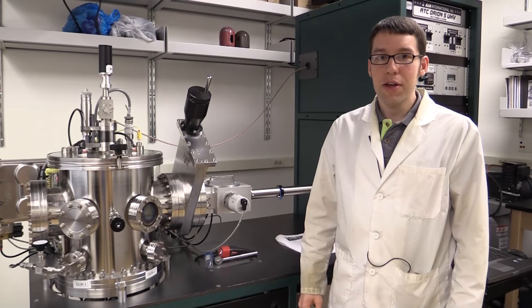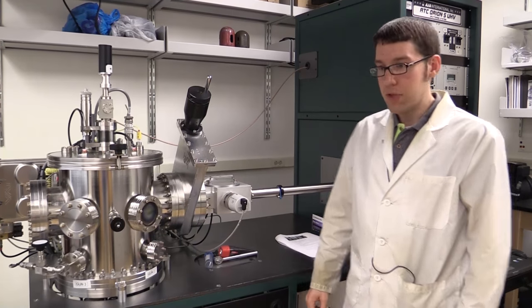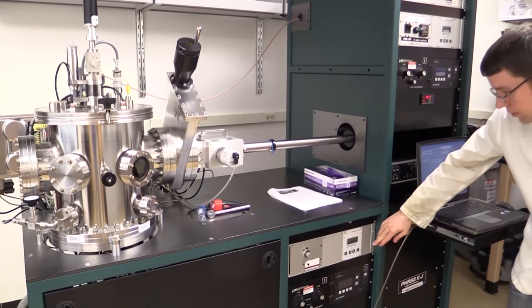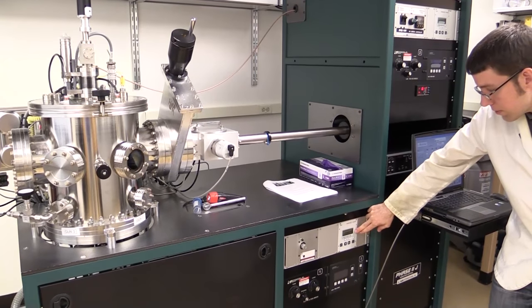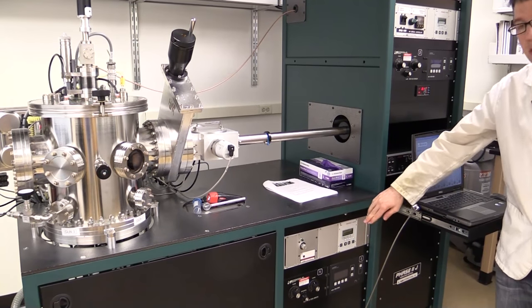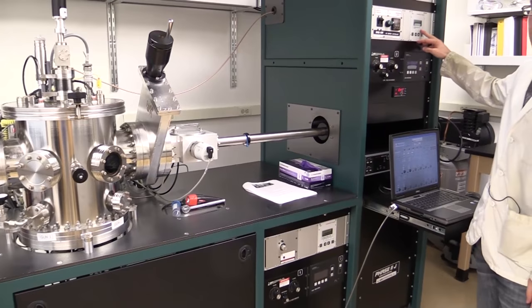Now we have a vacuum in the load lock chamber, which I can see on this pressure gauge. Currently, the vacuum is 2 times 10 to the minus 5 millibar, and we've matched the vacuum reasonably well with the main chamber, which is shown on this pressure gauge.